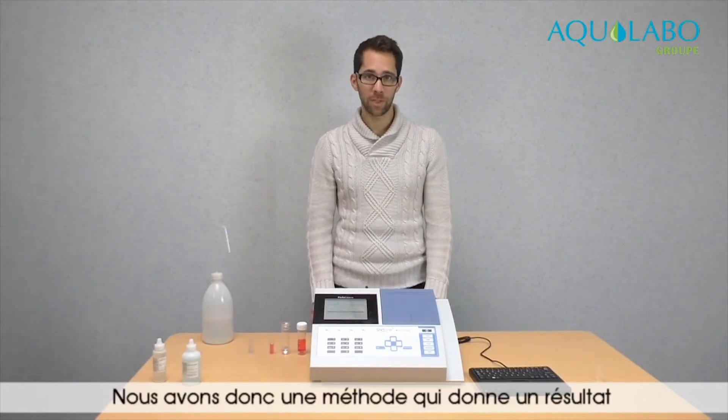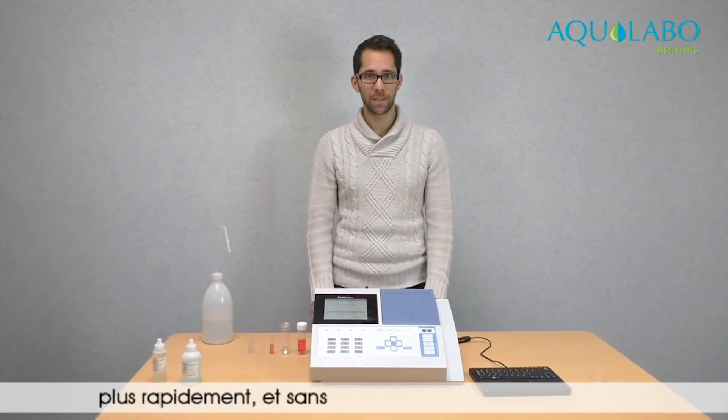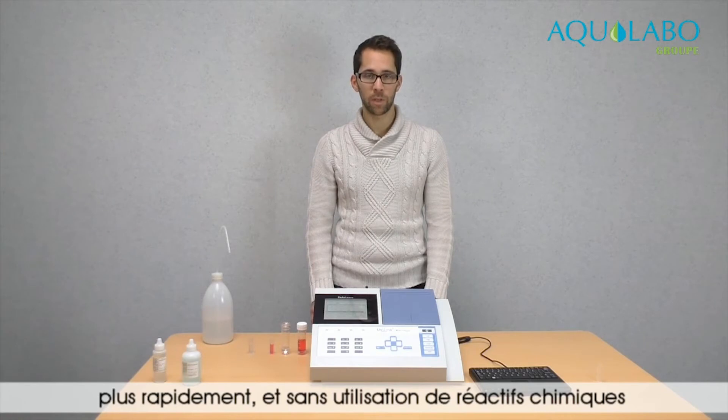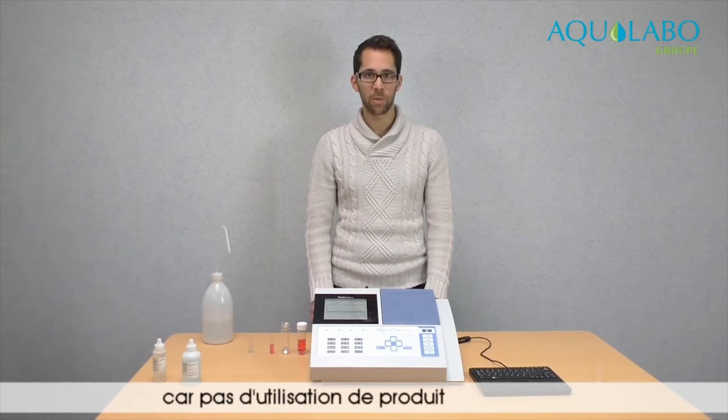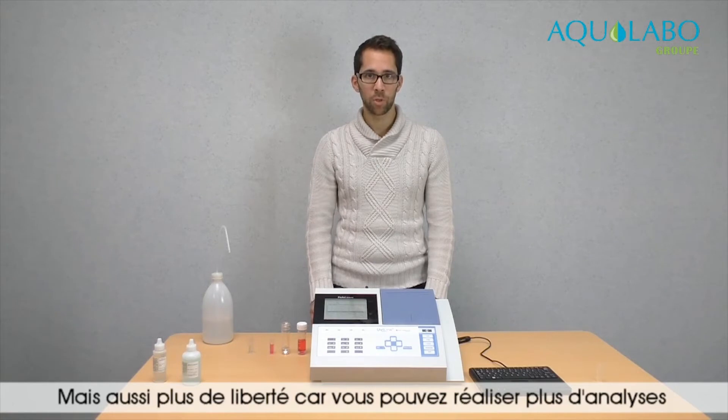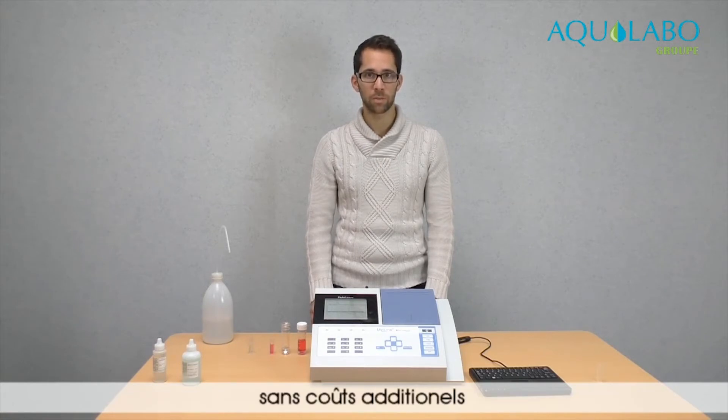So we have a method that gives the result in less time without the use of chemical reagents, which means saving money and saving time, but also more security because there is no use of dangerous products. And also more freedom, because you can conduct more analyses without additional cost.